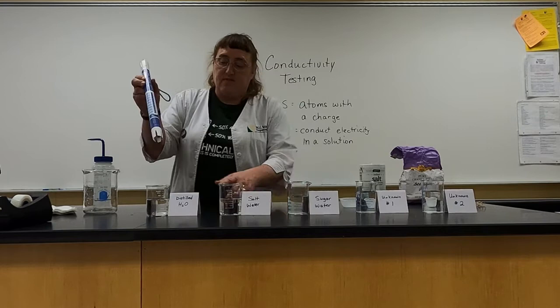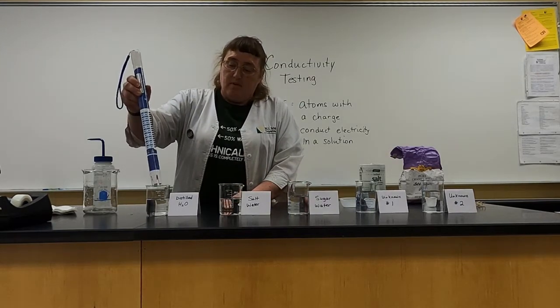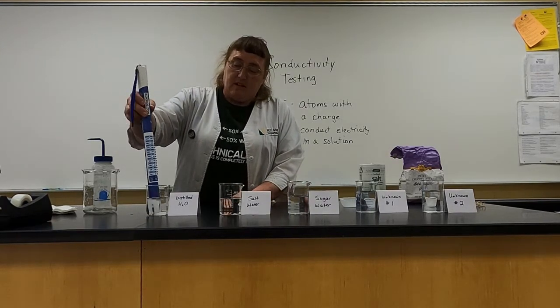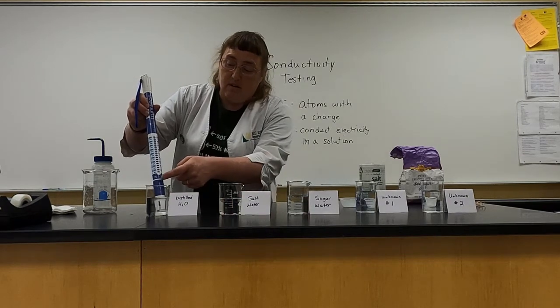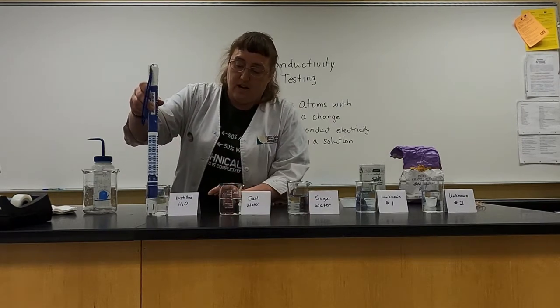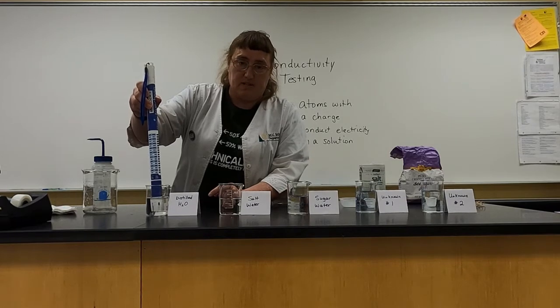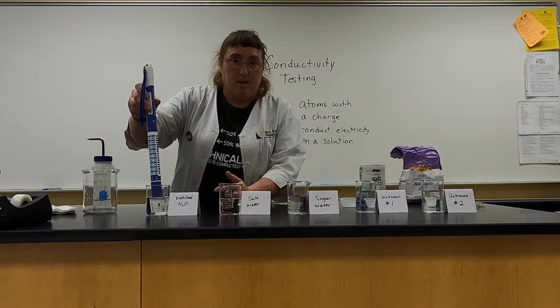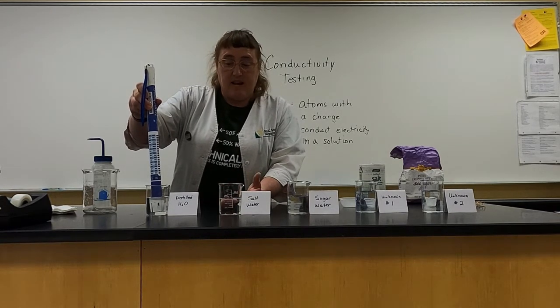In this first beaker we just have plain water. Plain water should not conduct electricity much at all, and you notice there are no lights whatsoever shining when you put the conductivity tester in distilled water, because there shouldn't be any ions in that water.